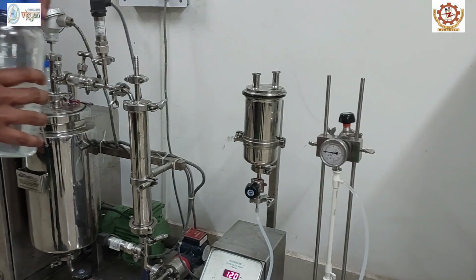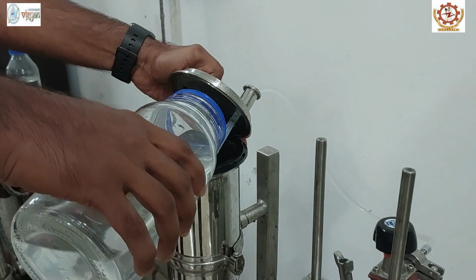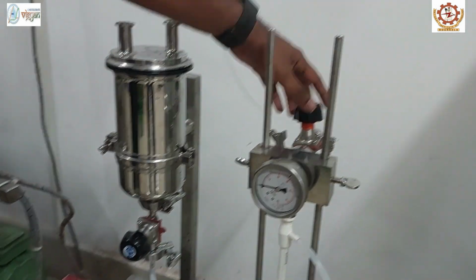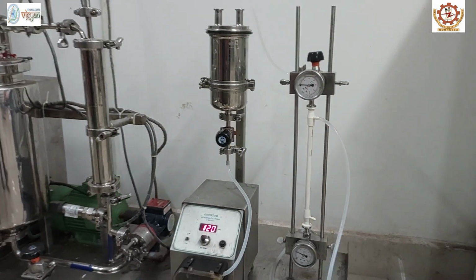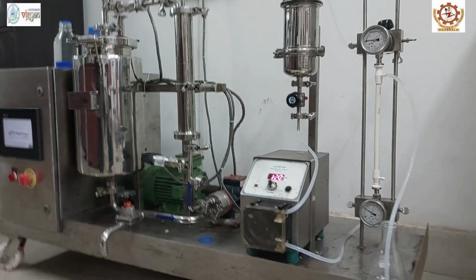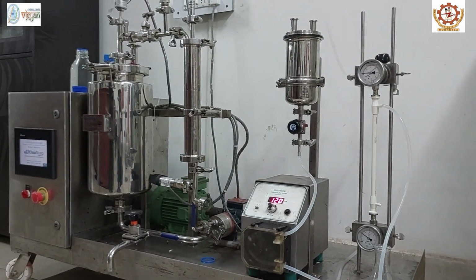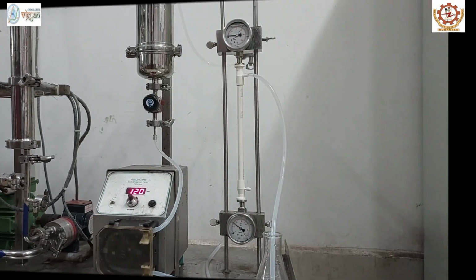The acid wash will be followed by a final tap water wash. For this purpose, 500 ml of tap water will be added into the feed tank, followed by opening the valve and reducing the transmembrane pressure to 0. The final tap water wash will also be conducted for a minimum of 30 minutes to ensure that the pH is back to neutral. This is how membrane washing is conducted.